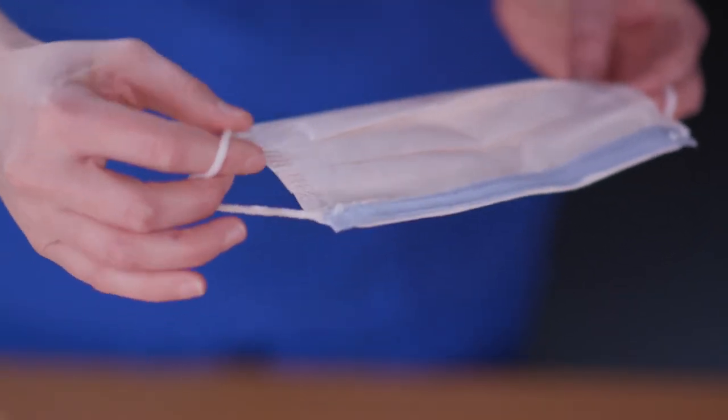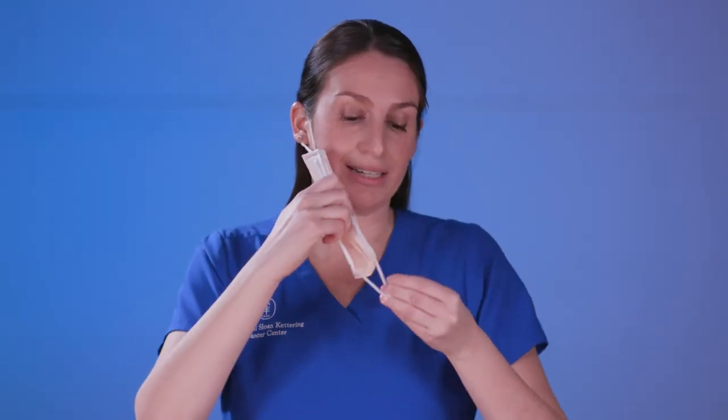Then you're going to take the mask, twist at the sides or tie, and properly loop them around your ears, creating a tight seal.